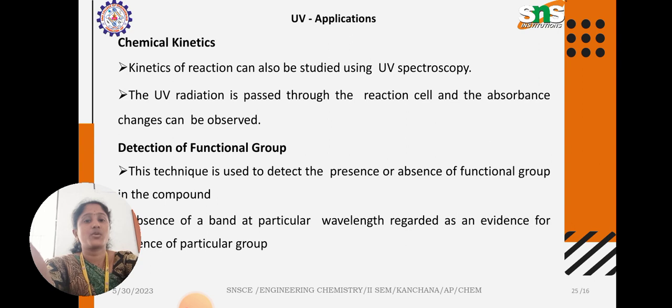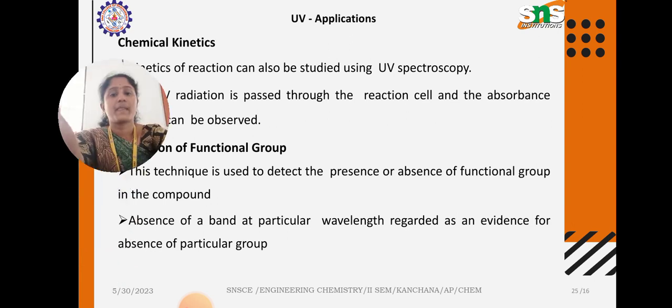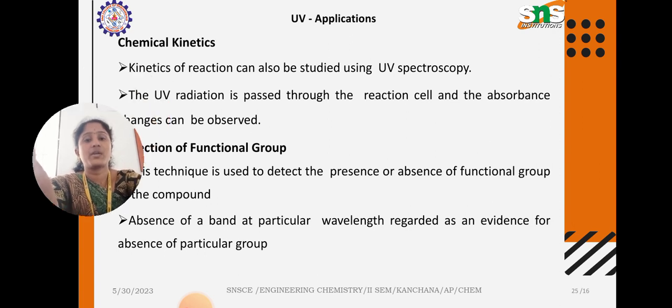Detection of functional group. This technique is used to detect the presence or absence of a functional group in the compound. And absence of a band at a particular wavelength is regarded as evidence for absence of the particular group.